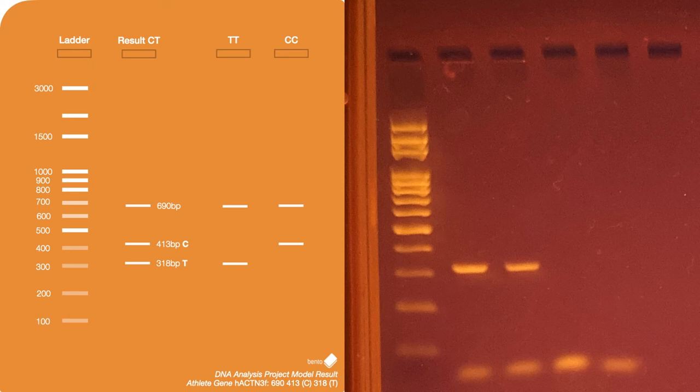What we are missing on this gel is the control band at 690 base pairs. After some reading, it's very likely the band is there but not showing up because PCR primers always favour shorter amplicons. What's probably happened is that a much lower amount of the 690 bp fragment amplified and was outcompeted by the 300 bp one. We'll look into adjusting the amount of primer in the mix, or potentially running two separate PCRs so the control band always appears alongside the athlete gene alleles. Otherwise it's a very neat workflow — thanks very much for listening, and stay tuned for next week's vlog.